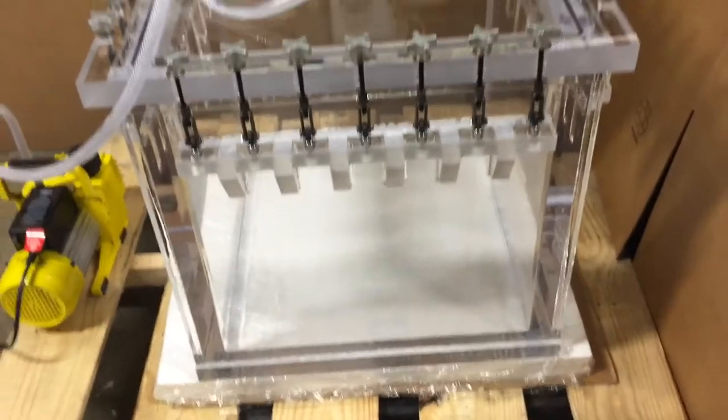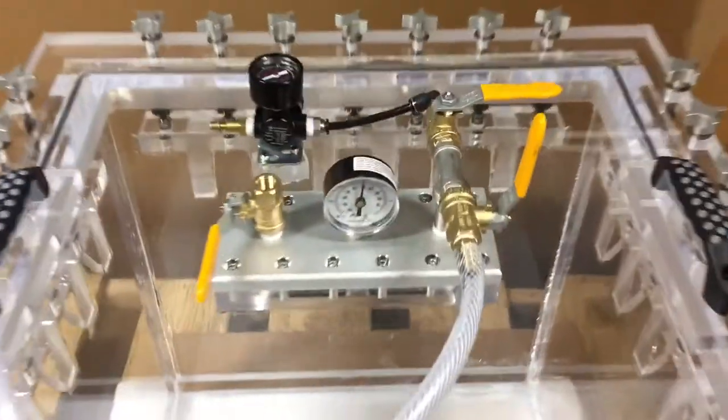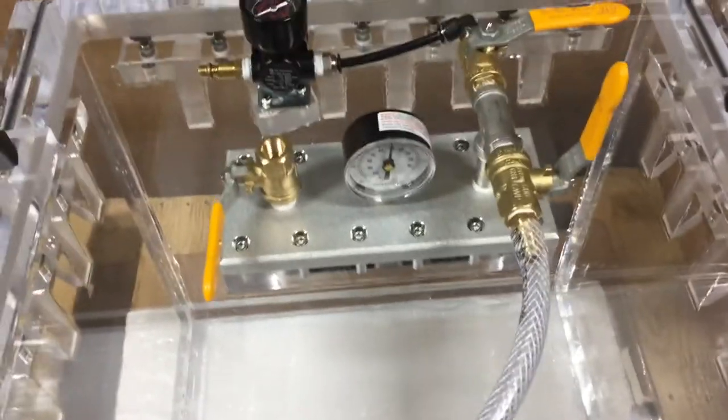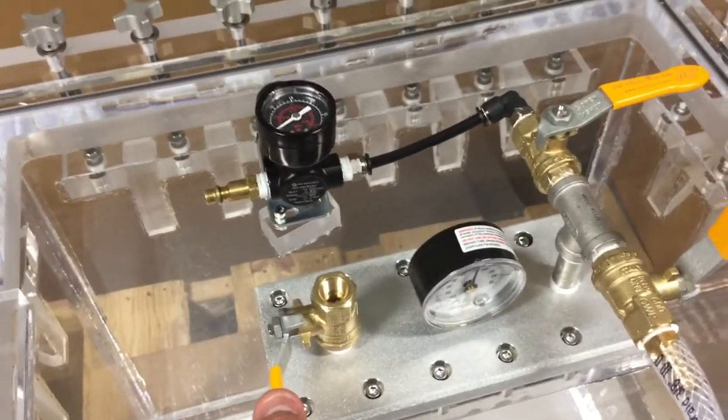There it is under vacuum. Now to release the vacuum so that you can pull the lid up, all you have to do is lift this valve right here and it's going to open it.